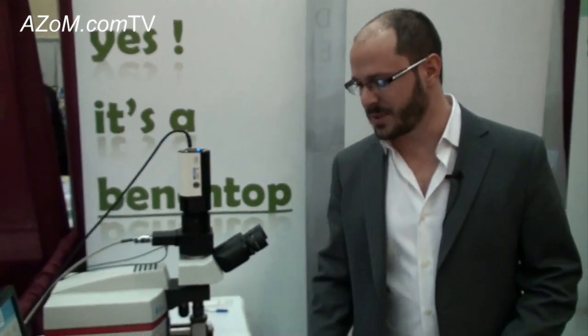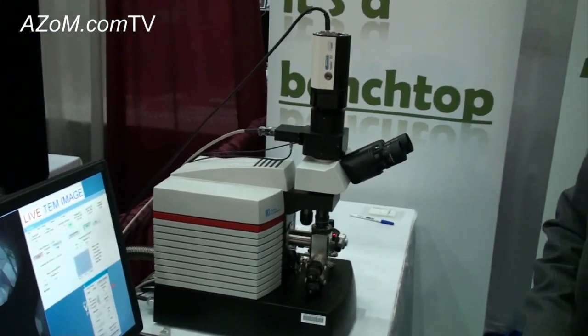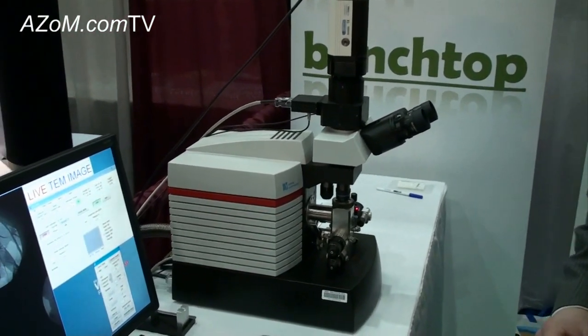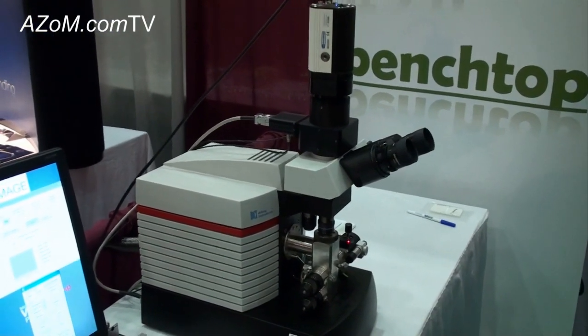The LVEM5 Benchtop TEM really is a unique piece of equipment. It's the only benchtop TEM available on the market. Not only is it a TEM, but it also operates as a FE-SEM and as a STEM as well.